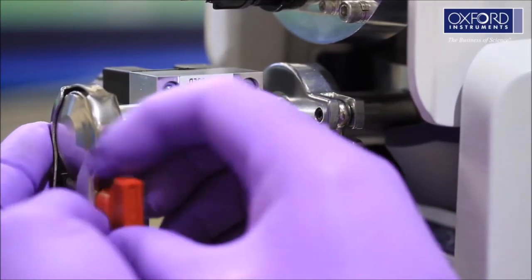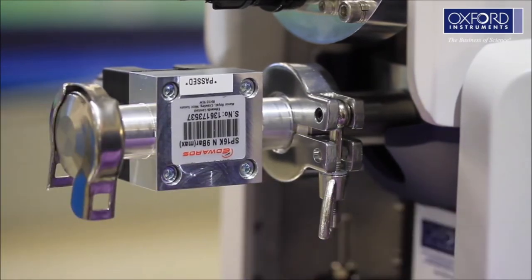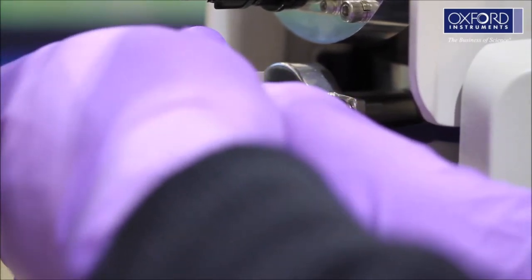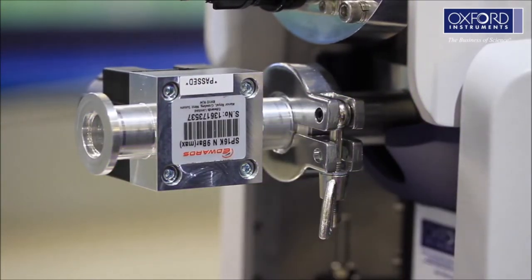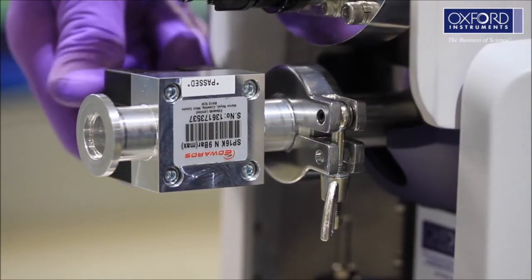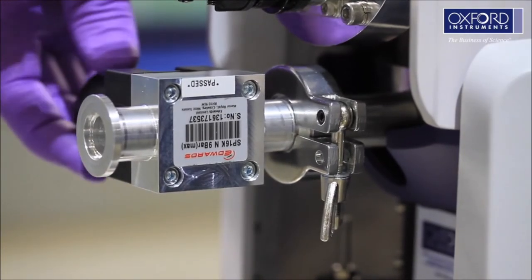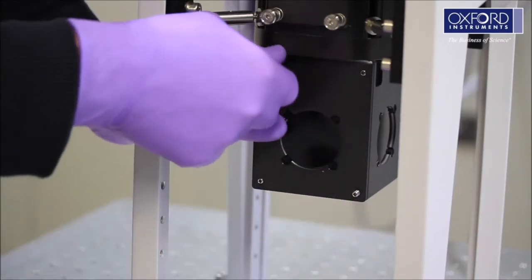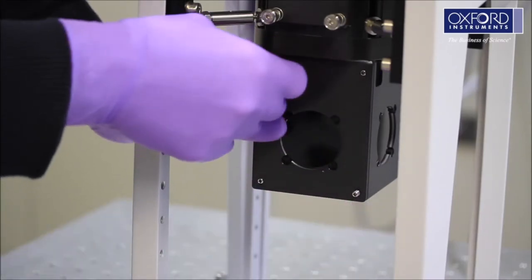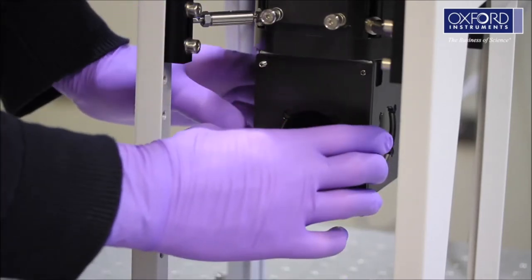Remove the blank from the OVC vacuum valve and open the valve to release the vacuum inside the cryostat. Unscrew the two thumb knobs and remove the sample access plate. Put this somewhere safe where it will not get damaged.